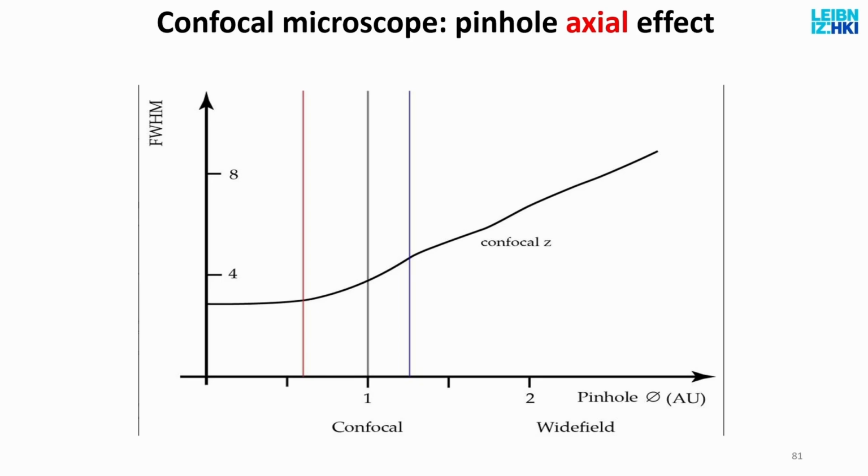Yes, thank you very much. So I just want to clarify something. We look at the confocal microscope, and you were highlighting the pinhole, and that would also be in relation to super resolution microscopes like the STED microscope. What would be the dynamics using this pinhole, since the STED microscope uses the donut aperture? What would the range be on this graph?